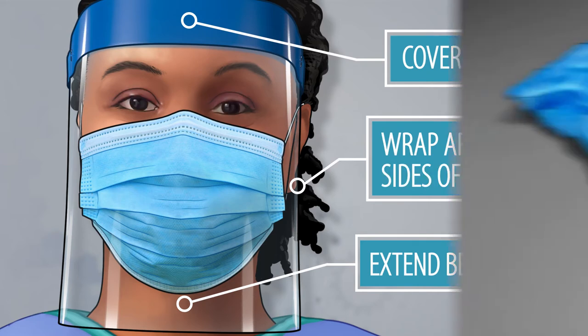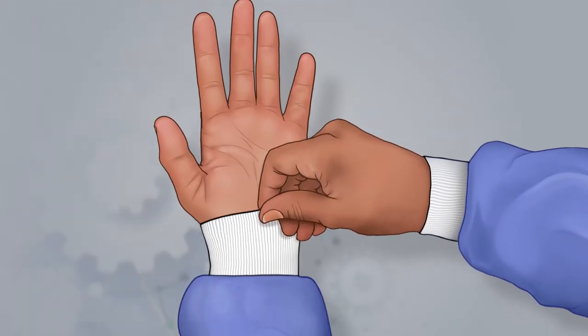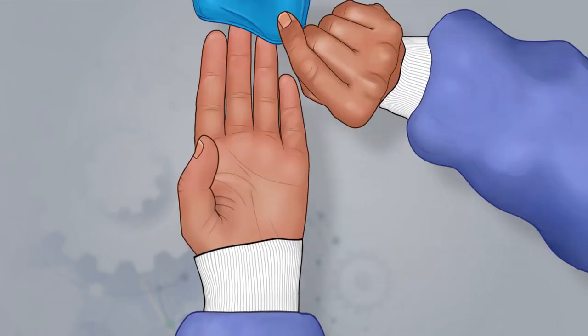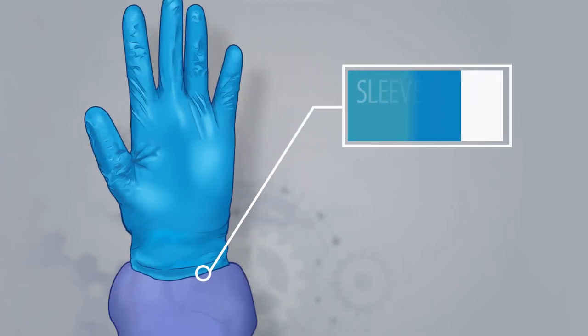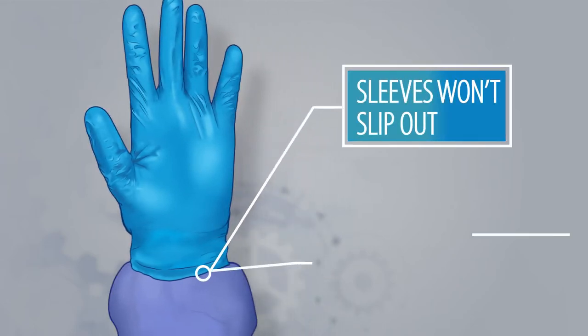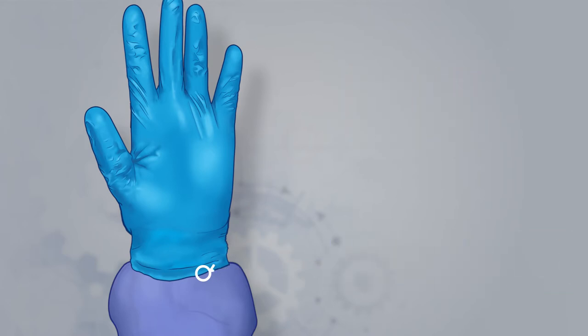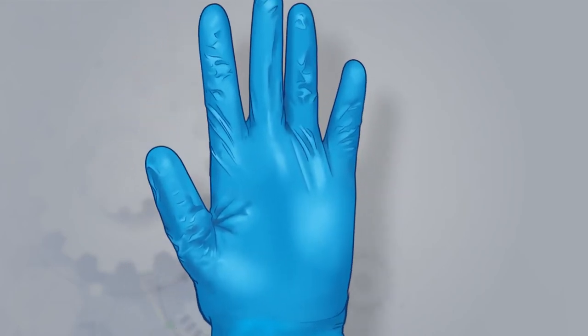Finally, put on your gloves. First, pull the gown's knit cuff down around the palm of your hand, and then pull the glove over, not under, the cuff. This helps ensure your sleeves won't slip out and the knit cuff won't be exposed to hazardous materials during work. Ensure yet again that there are no punctures or tears in the gloves prior to beginning work.